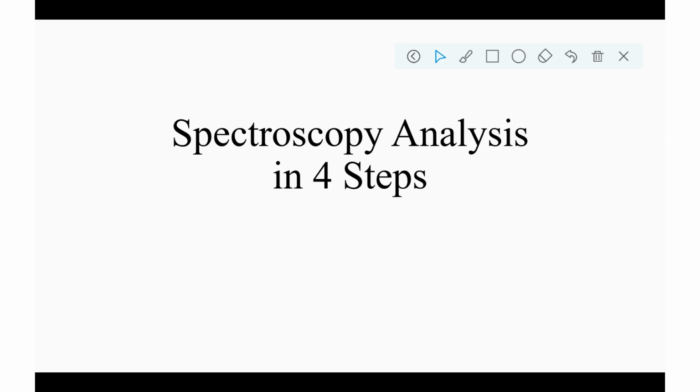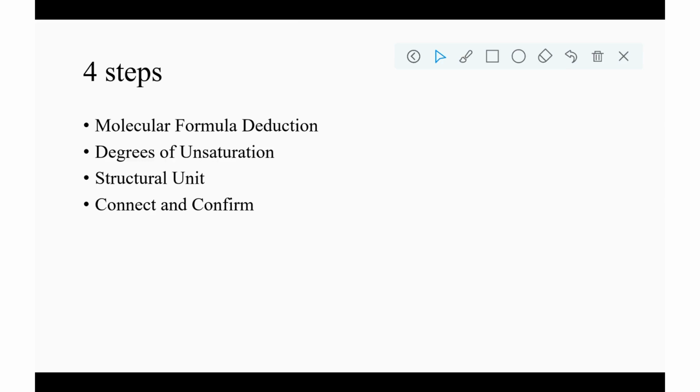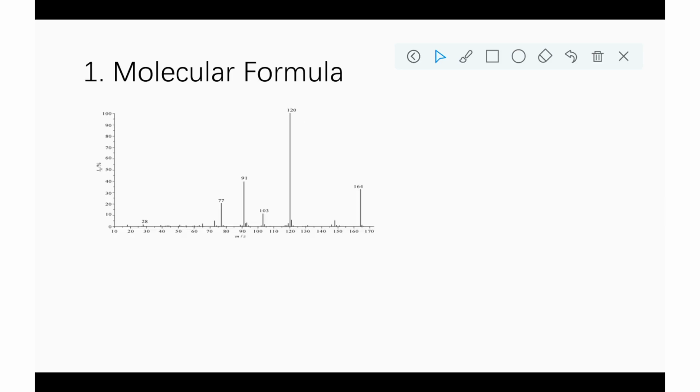Today I'm going to show you how to do spectroscopy analysis in 4 steps by using a specific problem. So these are the 4 steps. So first we need to find out the molecular formula.